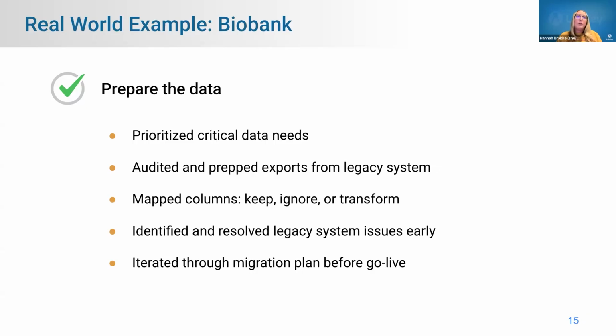The other thing that we were able to do with that iteration process is identify actual problems that had been in the legacy data prior to migrating. And so in some cases, there were sort of missed opportunities to have some of those data integrity pieces that our LIMS provides that the legacy system didn't. And so making sure that those got resolved ahead of time made sure that the data coming in was really clean and we were able to really shore that up.